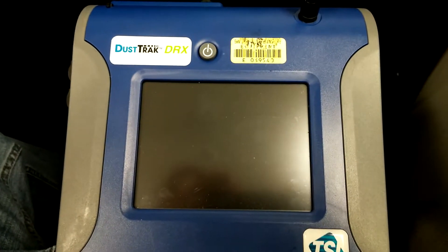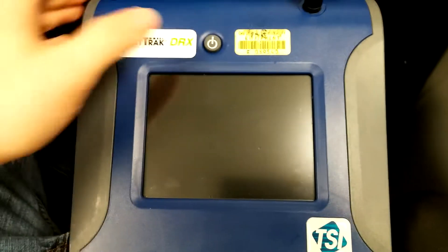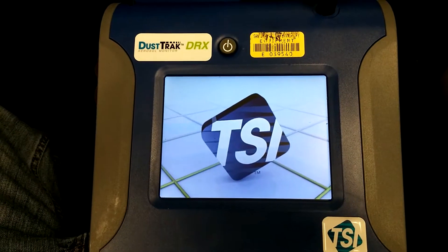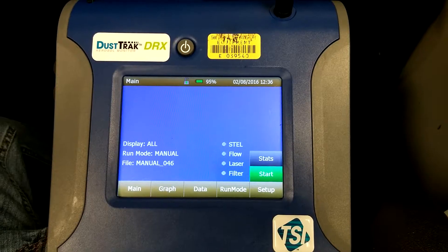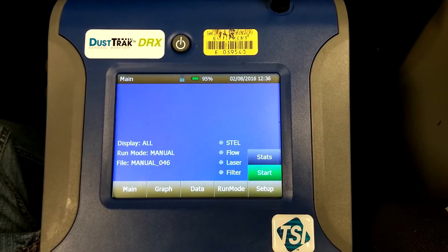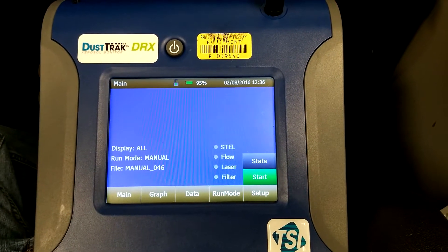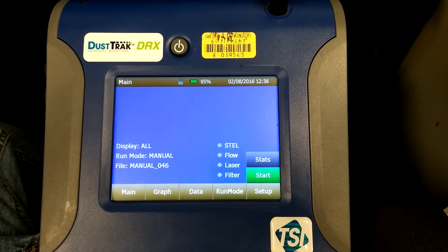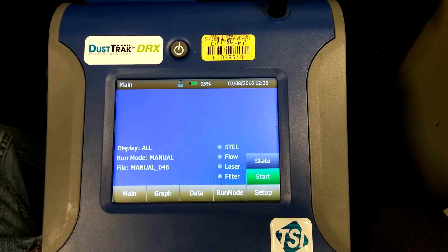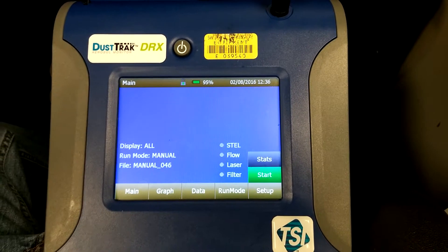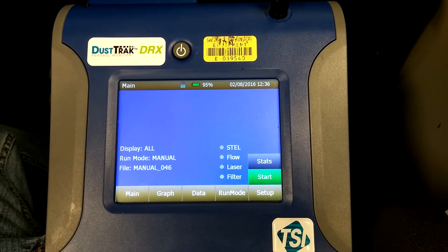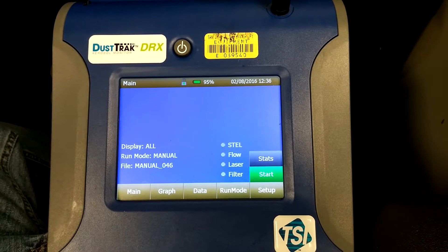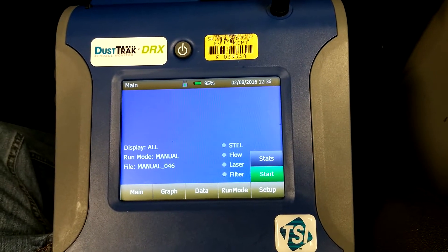Before you set the date and time on the DustTrak DRX, go ahead and press the power button and turn it on. It's very important to check the time before every sampling session, because you never know what might happen between other groups using instruments, or if an instrument hadn't been used before, or if the instrument's internal clock is just running a little slower than other devices.